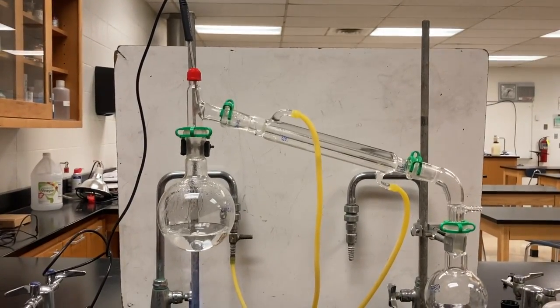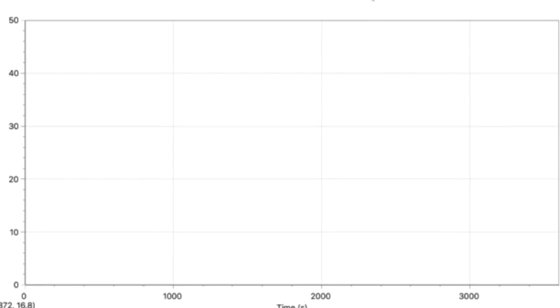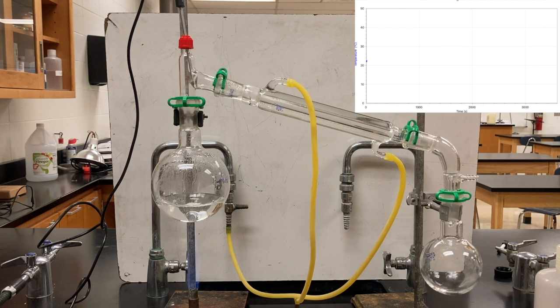So now we're beginning to see a little bit of movement. If you can look carefully, you can see the water beginning to move a little bit from energy heating. So here's the screen. Zooming in on the screen, you can see that the starting temperature is just a little above 20 degrees. That's room temperature, approximately.